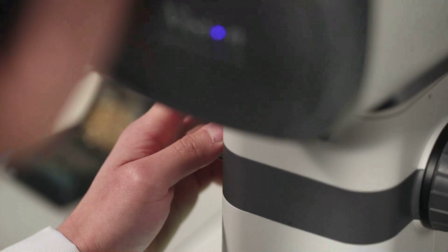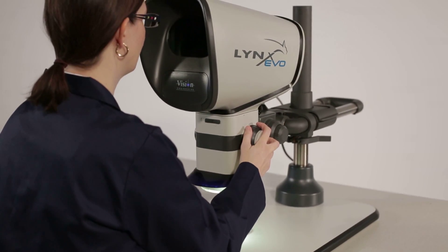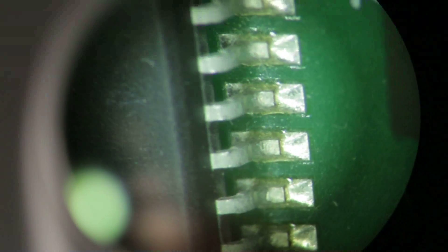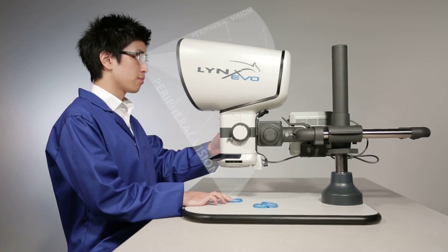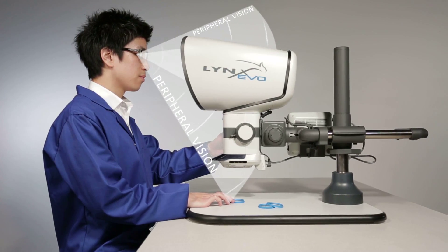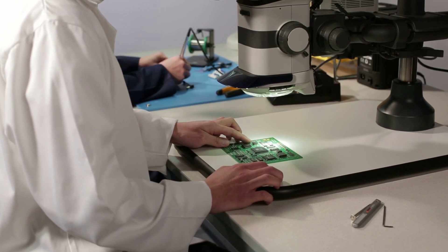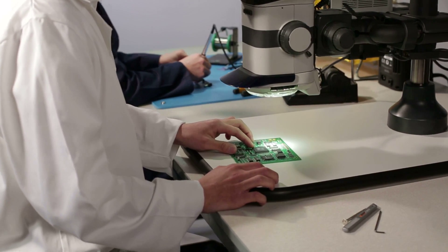The Lynx Evo advantage begins with stunning 3D stereo imaging, viewed through an ergonomic viewing lens. By sitting back from the viewing lens, users have significantly better peripheral vision, allowing a natural view of the subject with easy hand-eye coordination.